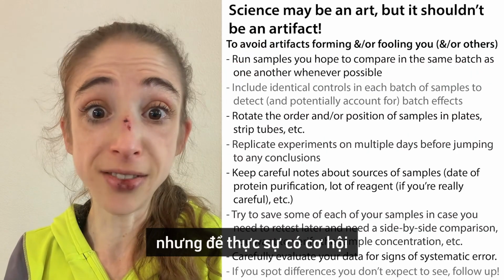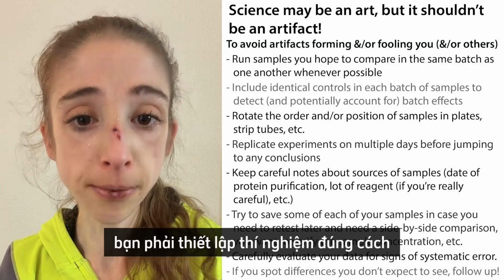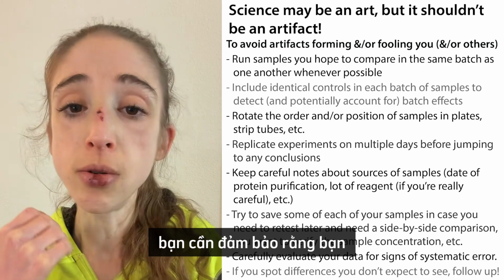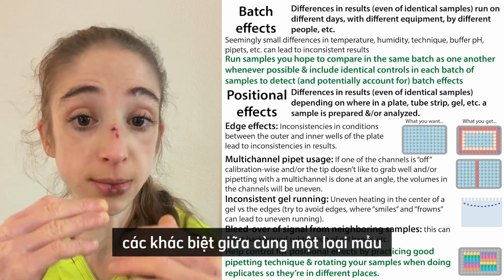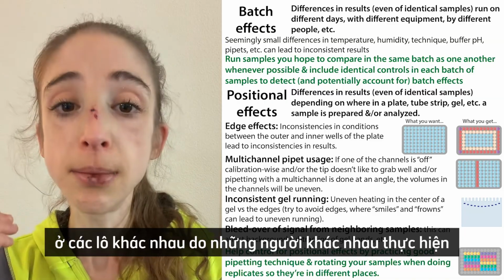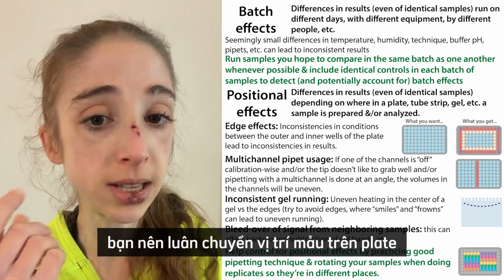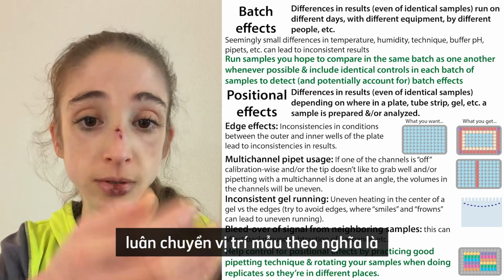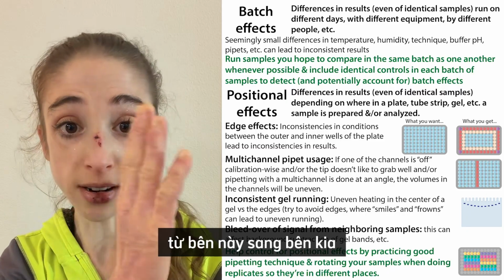But in order to actually have a chance to have good results, you actually have to set up your experiment correctly. And again, when you're setting up your experiment correctly, you want to make sure you have good technique. You want to make sure that you are looking for batch effects, differences between the same kind of samples on different days, in different batches, done by different people, all these things. You want to be rotating your samples in your plate. Avoid the edges whenever possible. Rotate your samples around in terms of where they are in the plate, where they are from side to side.